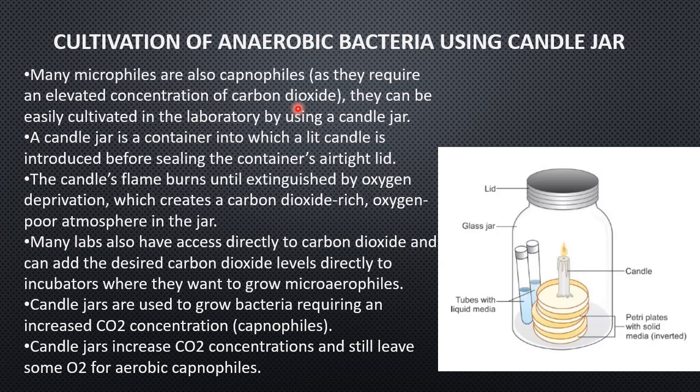A candle jar is a container into which a lit candle is introduced before sealing the container's airtight lid. The candle's flame burns until extinguished by oxygen deprivation, which generates a carbon dioxide rich and oxygen poor atmosphere in the jar.